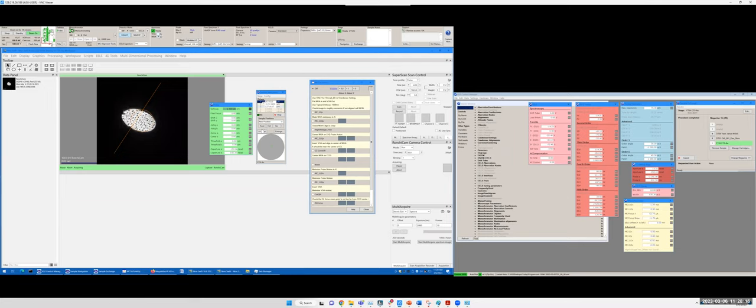So I want to take VOA out and I click this MC11DX. If you see that the gold particles are moving along this line, which is the X, that is wrong. We want the gold particles to be stationary along this line. Do you see the improvement? They are much more stable. I can go back. You can see the gold particles are moving around along this X line. We want to minimize that movement. So we change this control. Okay, at least now I think there's very, very little movement.